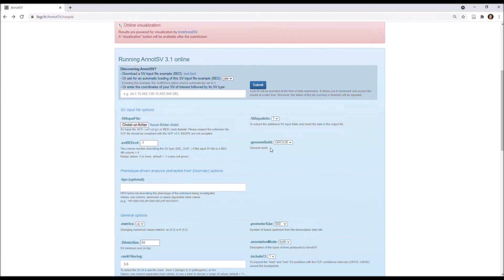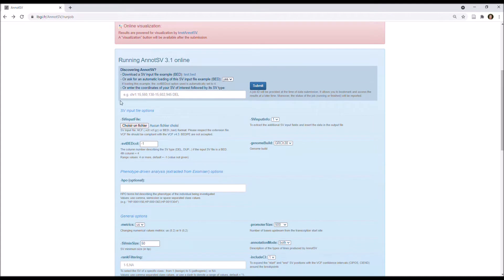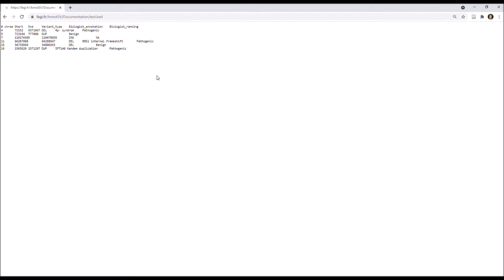Then, if you used a bed input file, you need to set the column number describing the SV type. And if you load the SV input file example, this option is automatically set to 4. Because, as you can see, the SV type is given in the fourth column. One, two, three, fourth SV type, variant type.